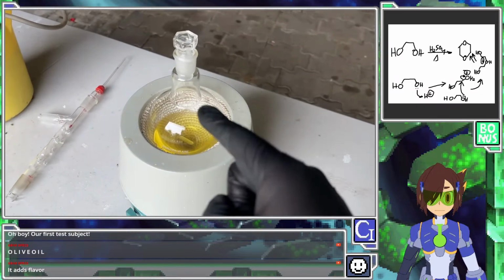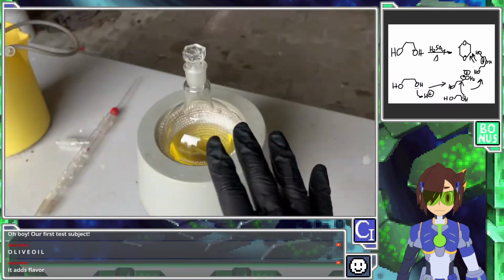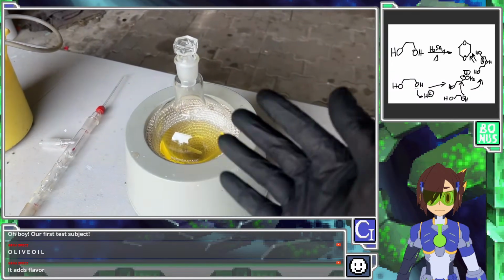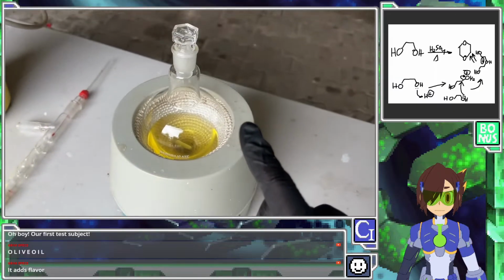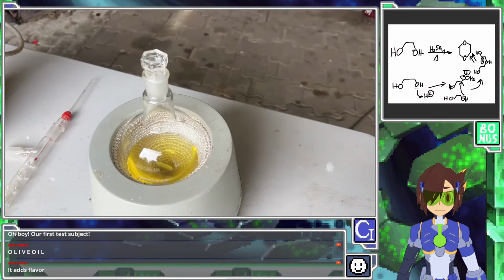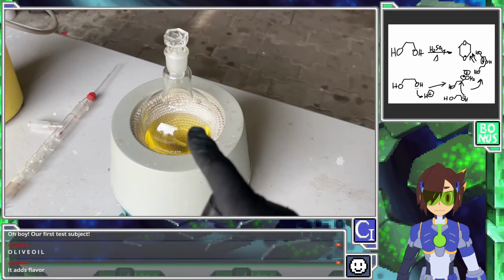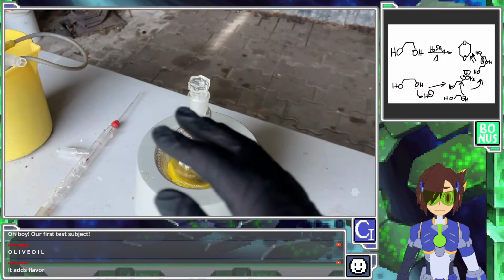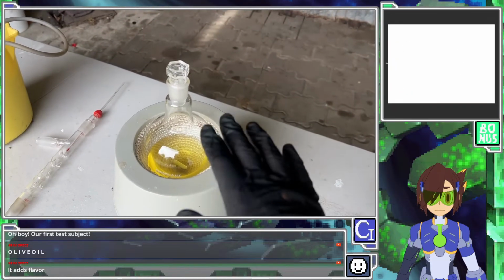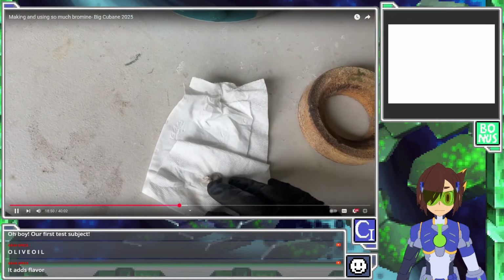Now, usually what people would do here is to dry the dioxane with sodium. And I wasn't going to do it because it's not really in the spirit of this series. We're trying to use chemicals from the hardware store. But it is a safety reason. I'm worried about peroxides in the dioxane because there was sort of a 2-week lag between making the dioxane and running this distillation. And what happens is if there's peroxides in there, which form from oxygen in the air and exposure to light and that kind of thing, they're not usually that dangerous, but as we concentrate it down, the peroxides can concentrate and then explode at the end. I have a little bit of sodium.